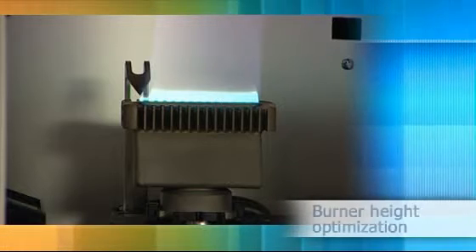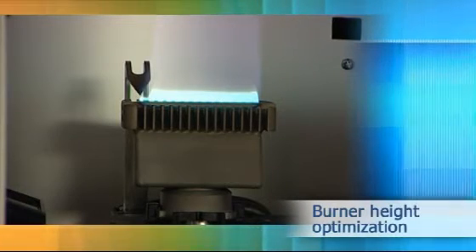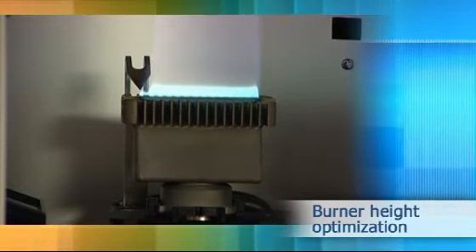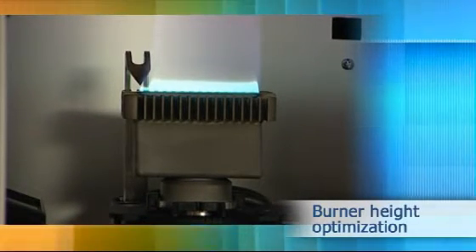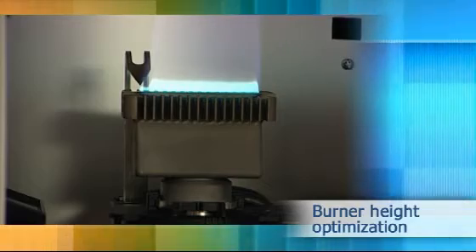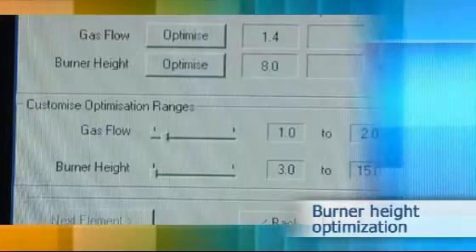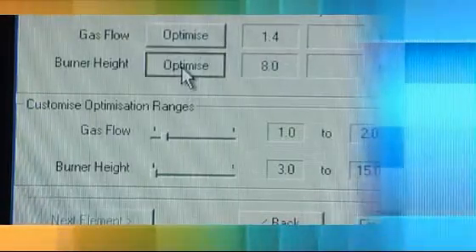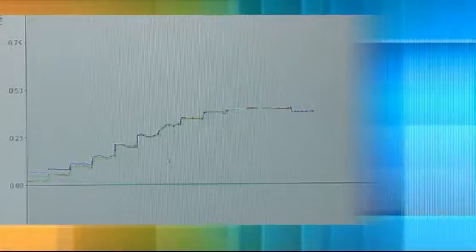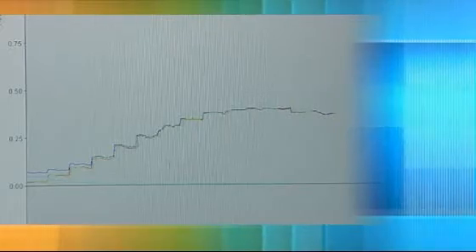The burner height can also be adjusted to ensure that the region of greatest absorption is measured. This is performed by a precise stepper motor under full software control. No manual adjustment is necessary and the process takes just a couple of minutes to complete.